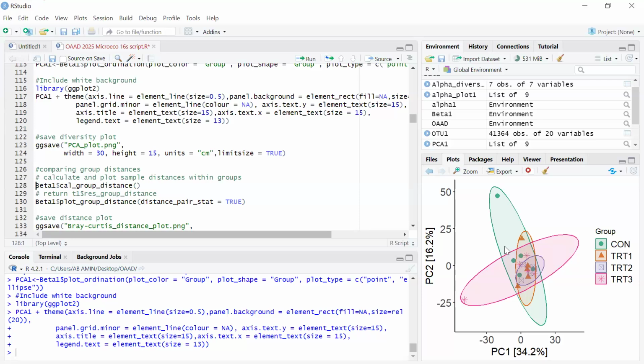Yes, based on the calculation method, they differ. However, based on explanation, they are almost similar, I would want to say. I think that's the easiest thing to say. They are similar, but if you use PCoA, what I'm saying is you don't need to use PCA again, because PCA is not specific for microbiome, while the PCoA is specific for microbiome.